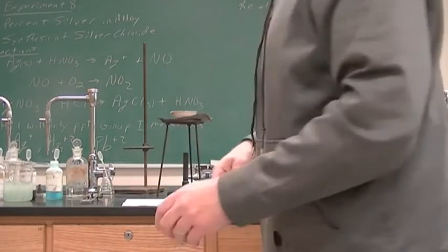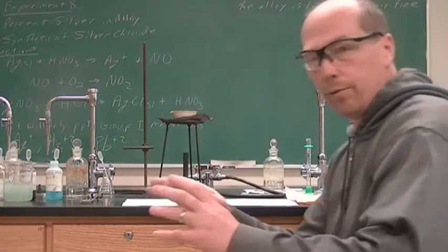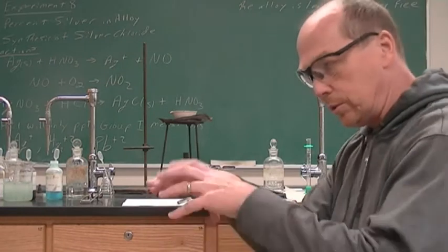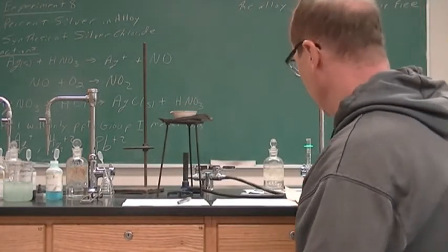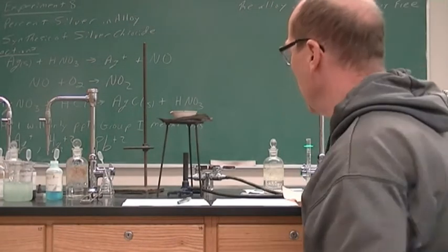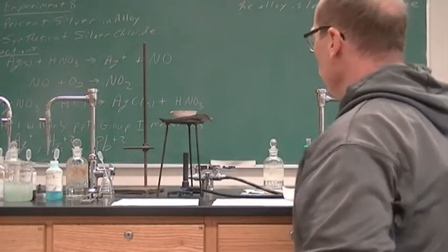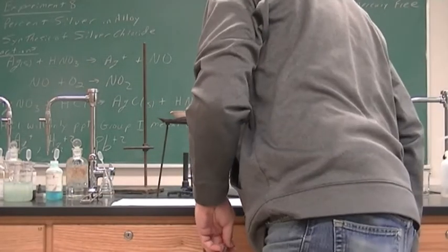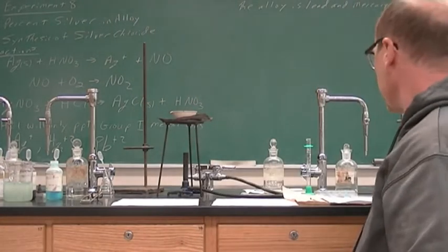You don't want the whole egg yolk flying out, so you can build up a lot of the liquid underneath there, and then it boils and it's trapped by that solid, and then it all boils out all together and flops out on the table. We do not want that to happen. So it is boiling at a nice rate. You don't want it to boil too fast.